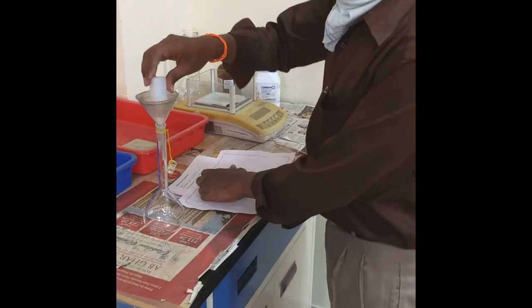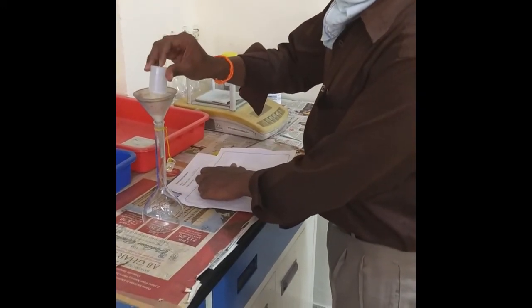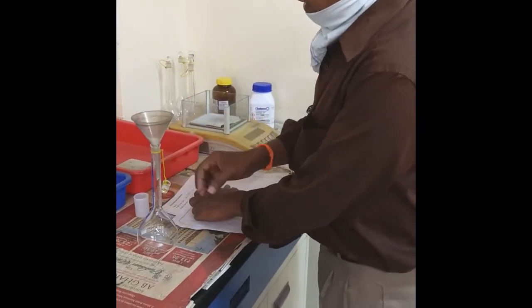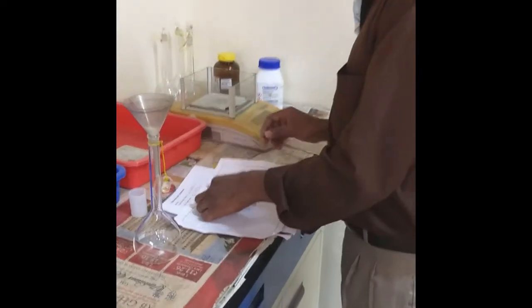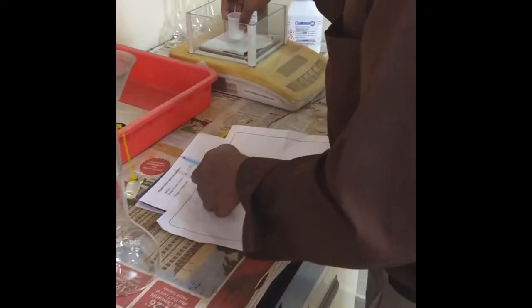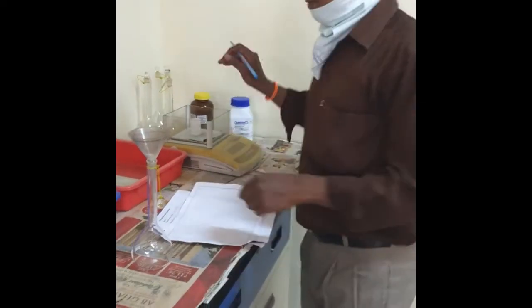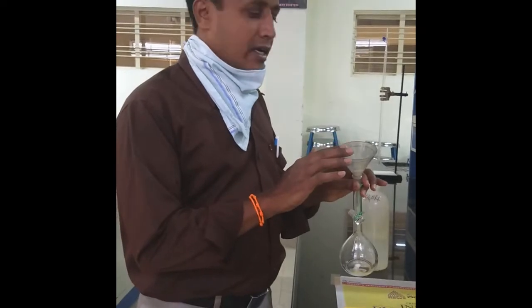I will be transferring this to a funnel with this volumetric flask, which is previously rinsed with distilled water. Then I will be taking the weight of weighing bottle alone, that is W2, which is coming to 3.5 grams. So the difference of this we need to take — that is the known weight of EDTA salt I have taken.